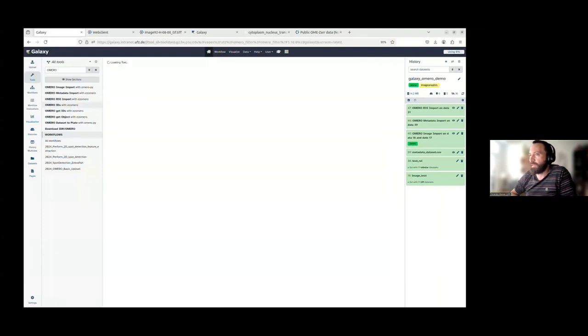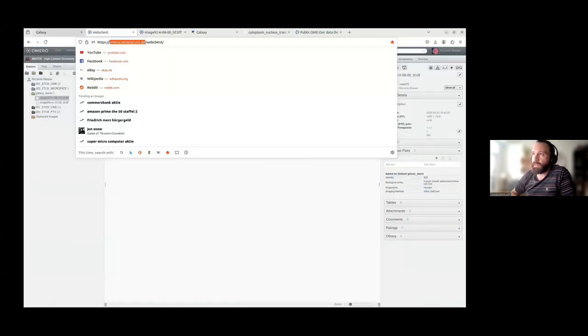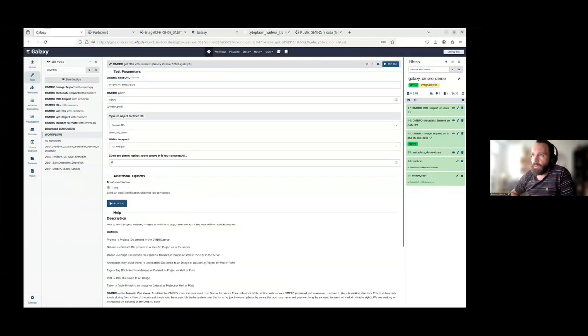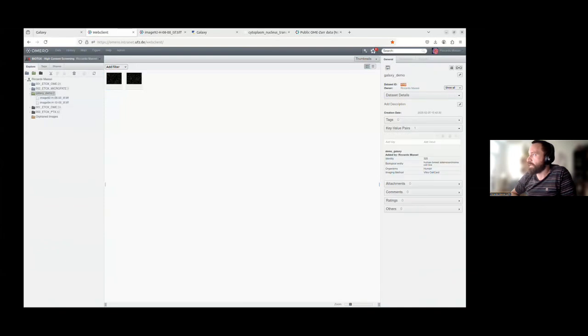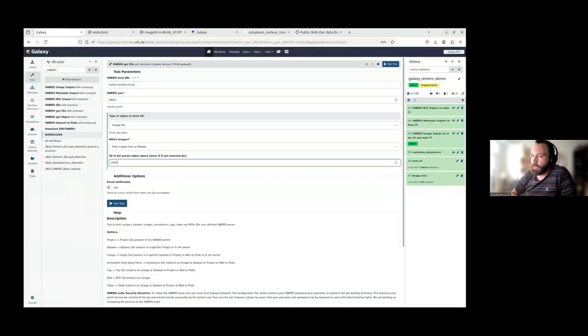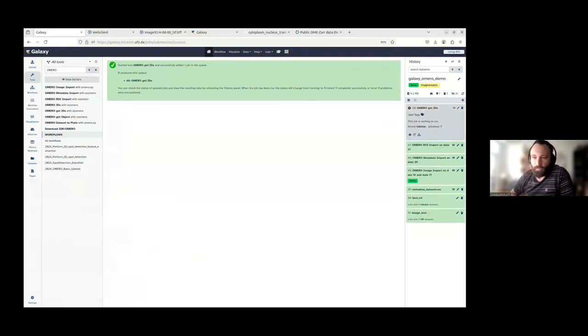I want to show you how to do some filtering. So if you have many images and you want to search with specific input, for example, I want to search all the images that are in a specific dataset. Again, I take the URL of the Omero and I do image ID, and I want to have all the IDs of the dataset 4169. And there are two images inside. I can run the tool, queued again. And then when it's starting, it should spit out the IDs of the images that are associated to this dataset. Starting.